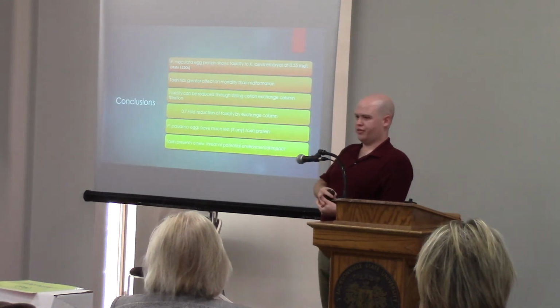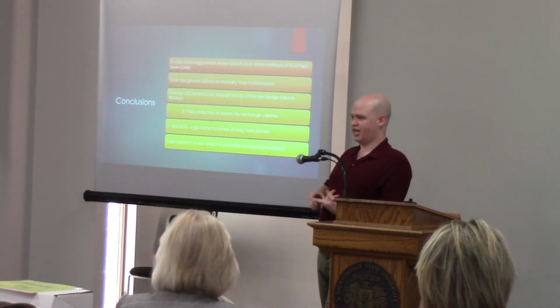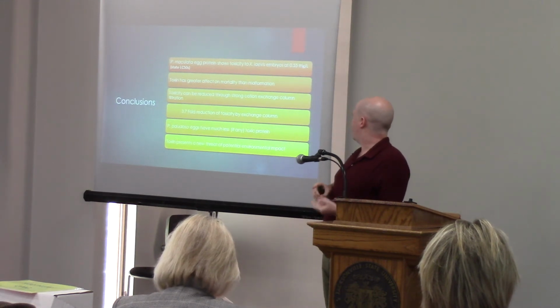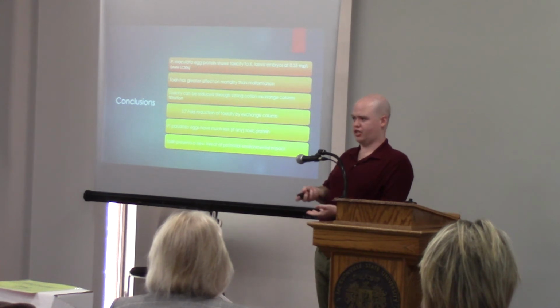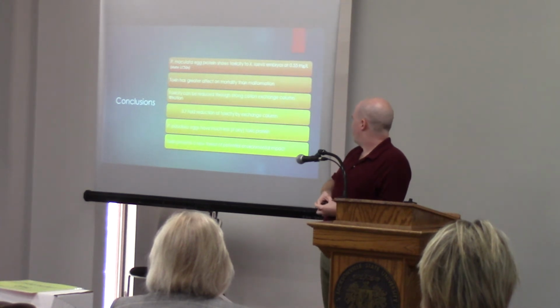So what we conclude from this is that Pomacea maculata, or the giant apple snail egg protein, does have a toxic effect towards Xenopus laevis, and it has an LC50 of about 0.55 milligrams per liter. The toxin has a greater effect on mortality than malformations, so it is non-teratogenic, does not cause malformations, it simply kills the individuals exposed to it.